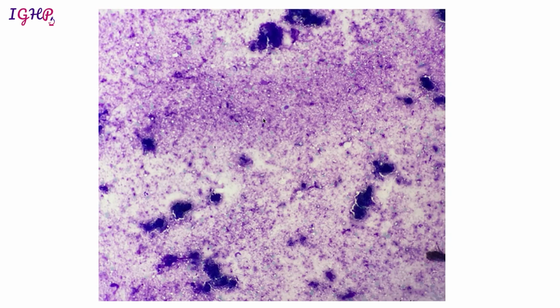Now suppose from the cystic lesion that we have described, we are getting a morphology like this. Now in this morphology, what we are looking at, there are hardly any epithelial cells here. There are numerous debris, there are occasional foam cells, and there is abundant dirty necrotic debris in the background. No definite epithelial cells, some clustering is there, but these are all the normal epithelial cells. So there are absolutely no epithelial cells here, numerous debris with the presence of occasional inflammatory and foam cells.